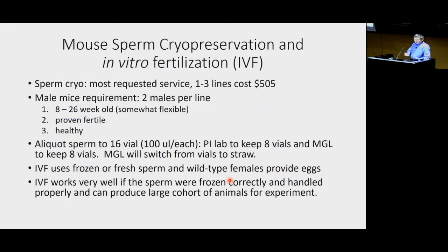So here are other services. The most requested service for me is the mouse sperm cryo project. Many people don't want to keep all the mice on the shelf. For MGL to cryo your mice, I require 2 males per line.